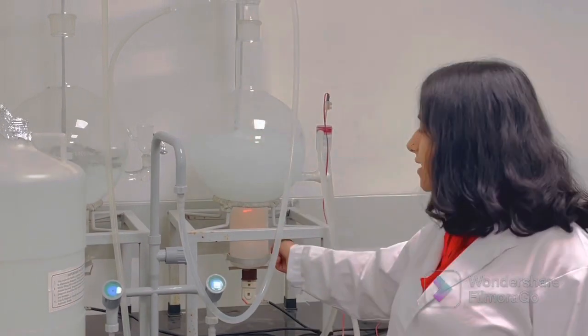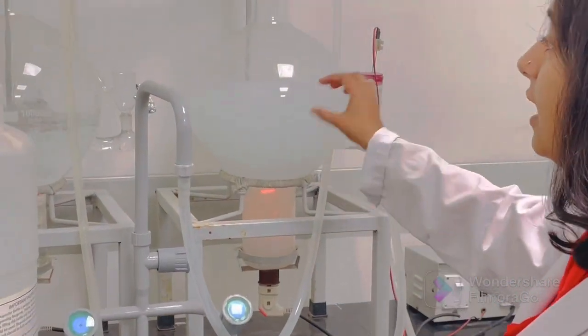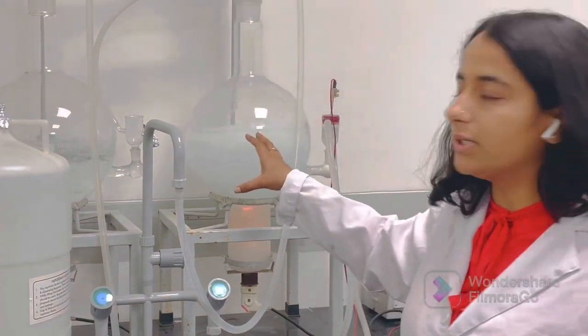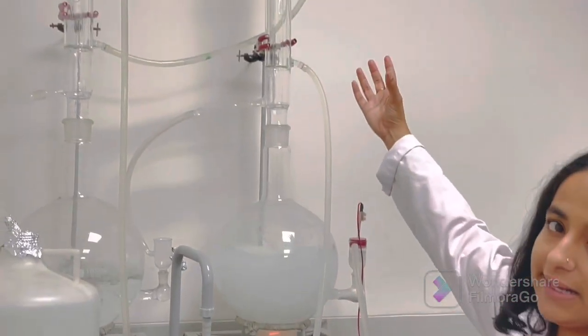Basically, here is a heating coil. It is used to heat this tap water. And since the boiling point of water is lower than all the contaminants, it gets vaporized to the condenser.